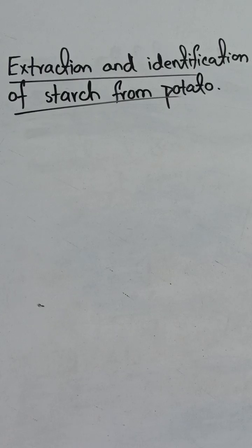So as you know, we have started the practicals over pharmacognosy. We have discussed the first 5 practicals. This is experiment number 6. Within the first 5 practicals we have discussed how to extract alkaloids, how to extract glycosides. So we have studied the extraction of different alkaloids from different plants. The first alkaloid that we separated out is from the hyoscyamus seed, second is from the Atropa belladonna, and the last is nicotine from the tobacco.